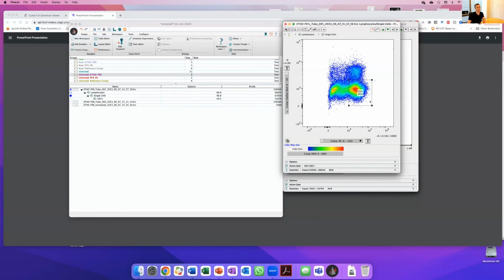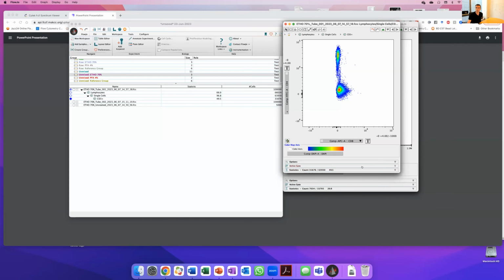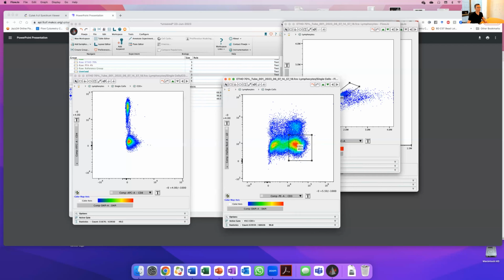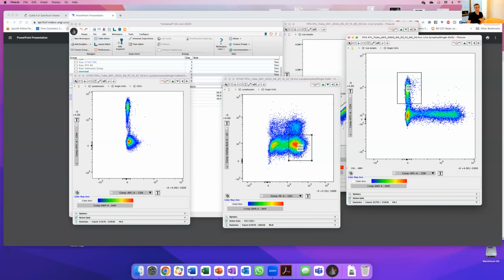And then from here, I'm going to select CD4 and CD8. So let's say CD4 here, great separation. CD8, oh, not so much. Do you see here that we don't have any CD8 positives? Whereas when we were looking at the, let's see if I can go to that one now without losing too much time. This is one of the issues with FlowJo, oh, actually I closed the wrong one. Do you see here the signal that we had with CD8? CD8 is labeled with APC, compared to when we fixed it with ethanol.